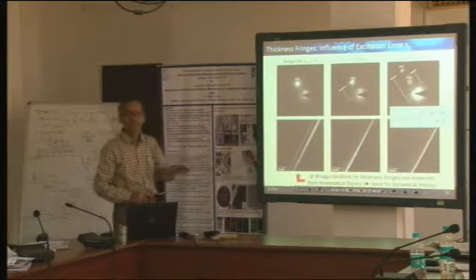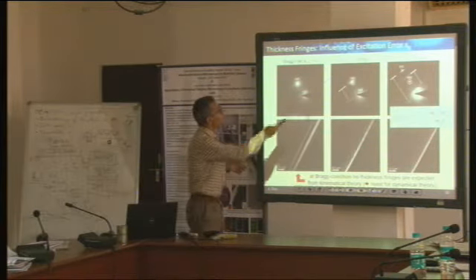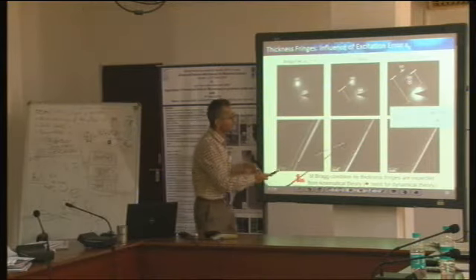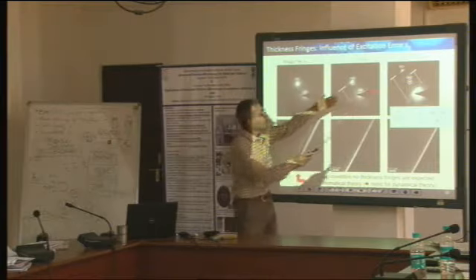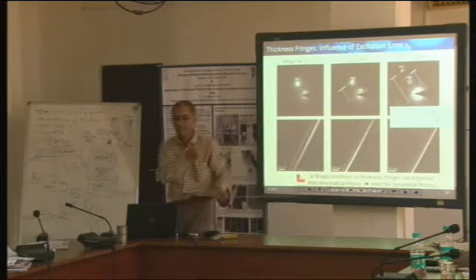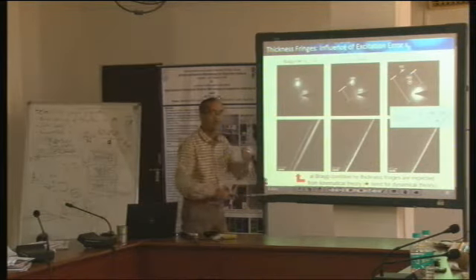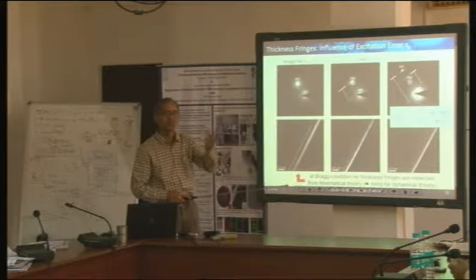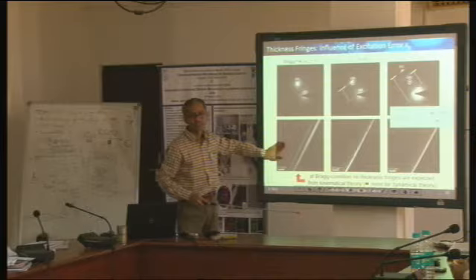But now with dynamical theory, we can still explain those fringes. When S is small, we get the fringes, but the spacing between the fringes has changed. If we make it even worse, then the fringes become even smaller. All these effects can be explained; in fact, the spacing changes can be understood by kinematical theory also. But this would not have been possible to understand with kinematical theory. This would have required that.